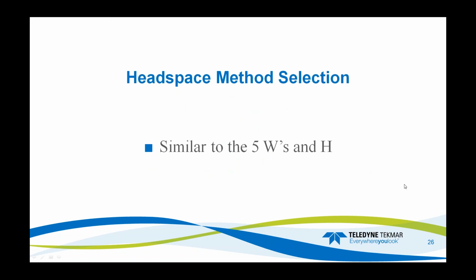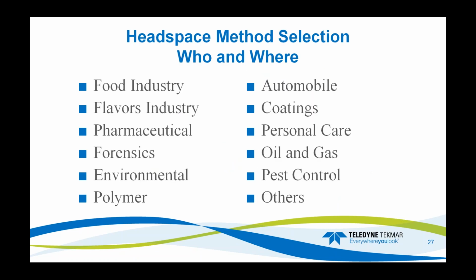Now I want to start working on the headspace method selection. It's very similar to what you've learned throughout your careers, the 5 W's and H. Who, what, where, when, why, and how. Who and where would this headspace method be used?